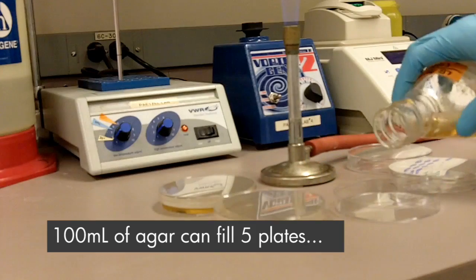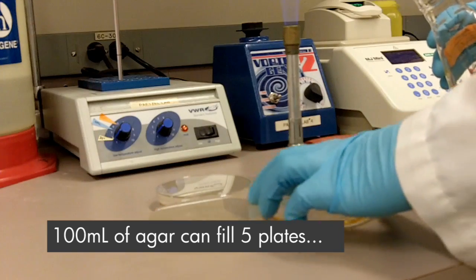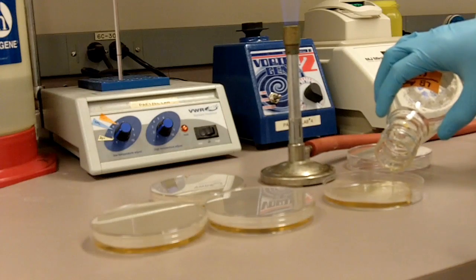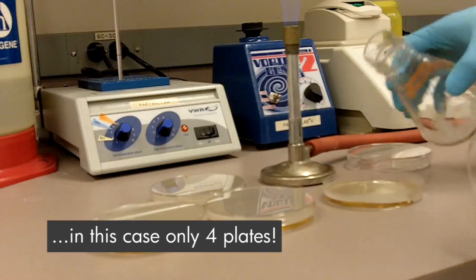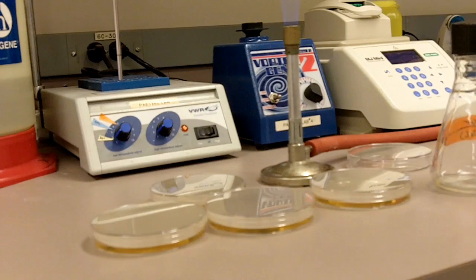Let's go ahead and pour it into approximately 5 plates. Pour 4 plates — pour 4, if you suck. And that's it. That's how you pour plates.